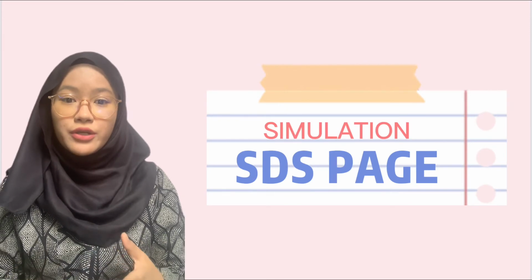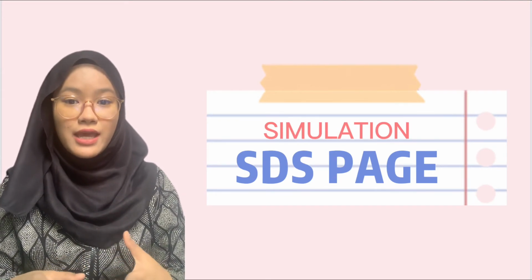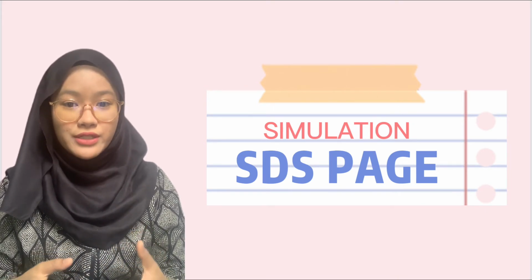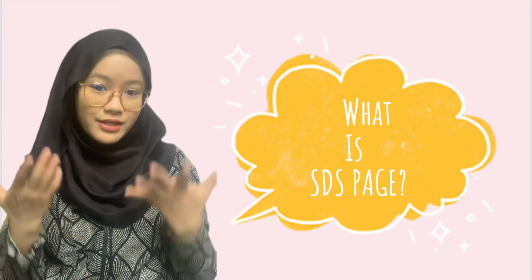So today I'm going to tell you about the theory and principle of SDS-PAGE, and also a virtual experiment simulation of SDS-PAGE. So what is SDS-PAGE?